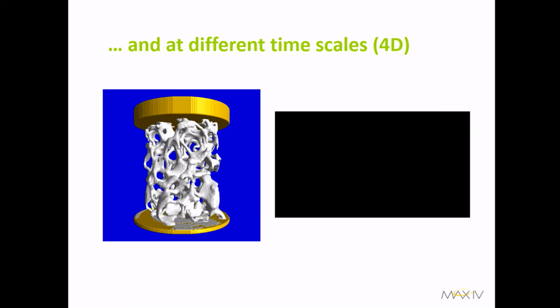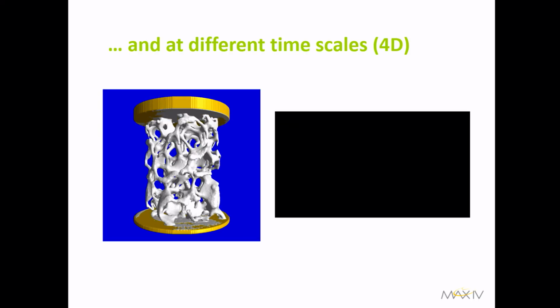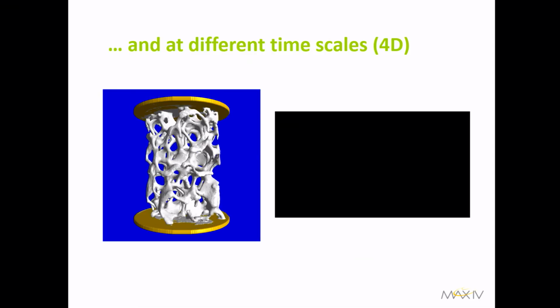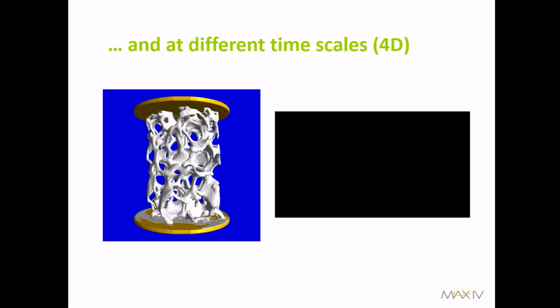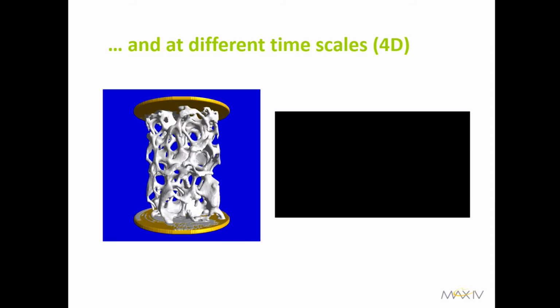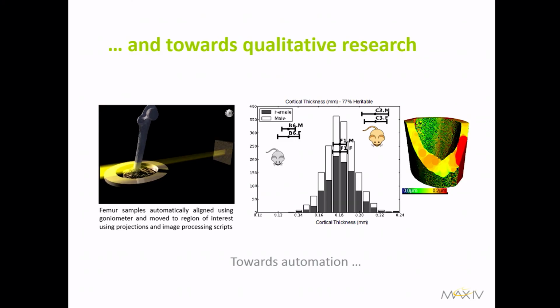So he will talk more about how he's working now on lung models to study the effects of ventilation and ventilation damage. He's studying hearts to look at damage from heart attacks or damaged tissue, etc. So it's a lot of functional studies all of a sudden just becoming available because of improved coherence. You can get the dose down, you can start to look at things while still retaining the biological relevance and not getting the radiation effect in the biology too much. It's a lot of potential.